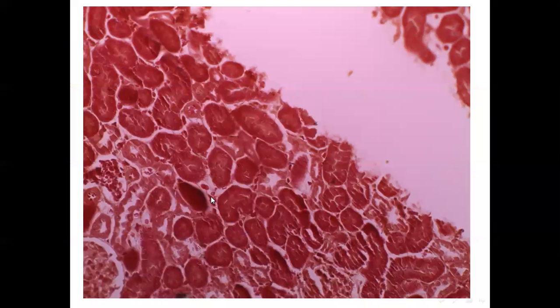Also, this figure demonstrates the mitochondria inside what? Inside each tubule. All this tubule, this tubule, and also this tubule. Inside each cell of the tubule, there are mitochondria in this shape. Inside each cell of the kidney tubule, there are cytoplasmic organelles called mitochondria, shown with the special stain. Also in this area, as a rod.